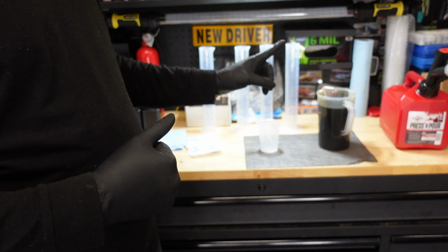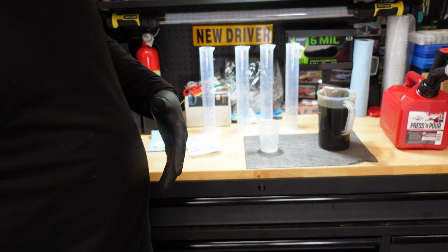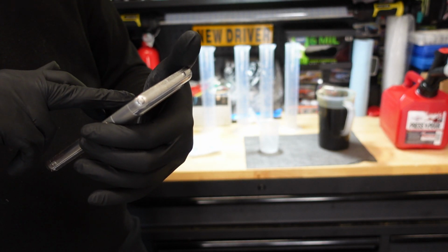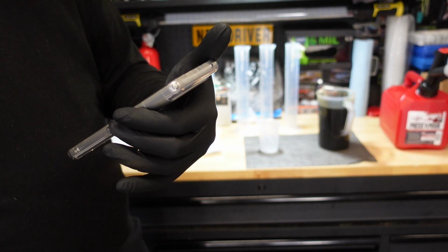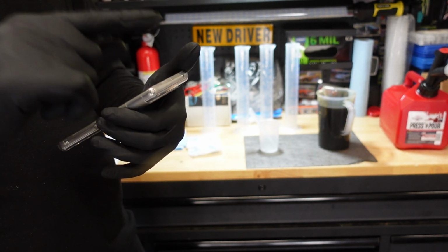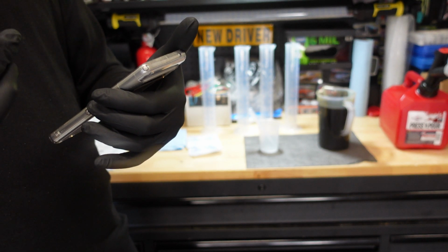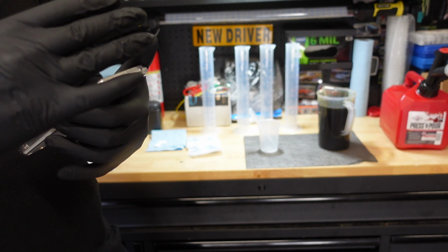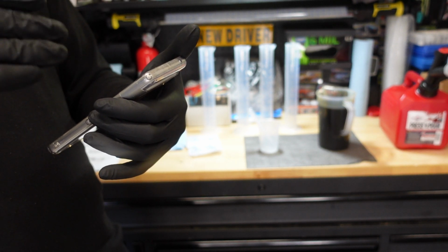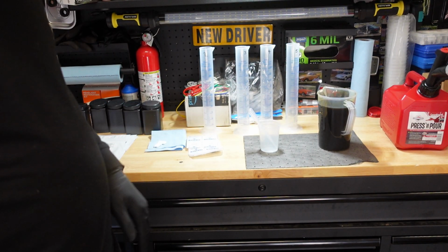One quick thing I do notice, let me get my phone out real quick. I'll tell you the method that they use. They use ASTM D92 for the flash point, and then from the flash point, they derive the fuel percentage. Basically, what they're saying is that every 20 degrees below the flash point should translate to 1% fuel dilution. Okay, so all well and good.